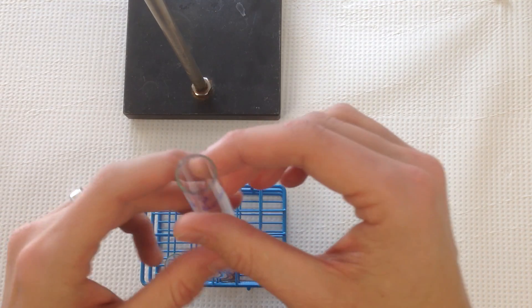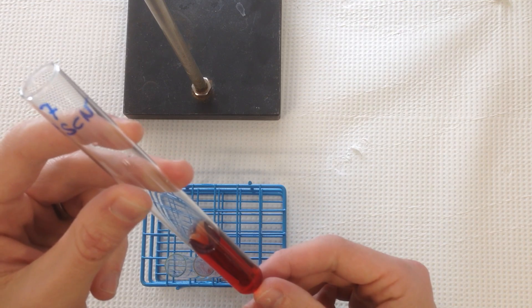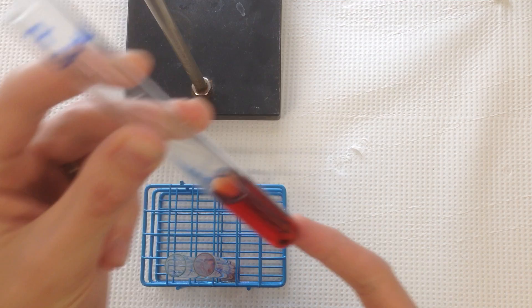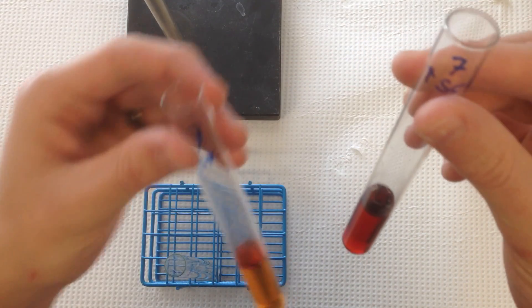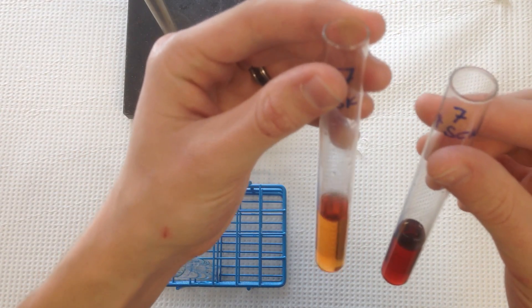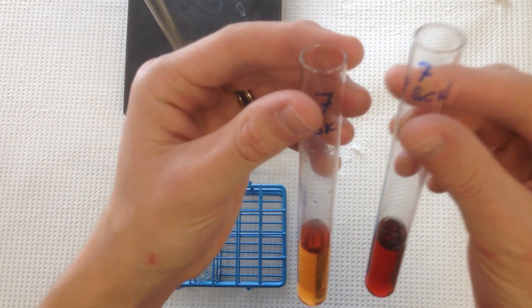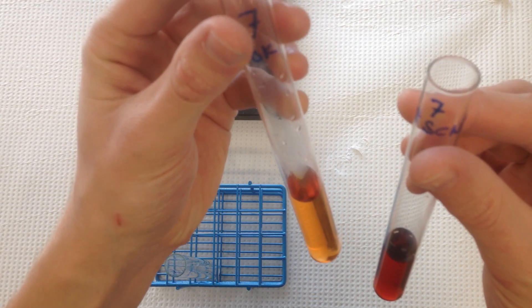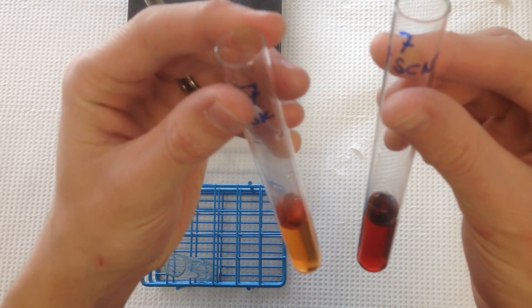Now, if you use the extra concentrated thiocyanate solution instead of the .0025 molar stock, you end up with something much darker than the orange that test tube 7 really should look like. What it should look like you see on the left, and what you get if you use the overly concentrated .5 molar thiocyanate you can see on the right. So make sure to use .0025 molar thiocyanate rather than the much more concentrated .5 molar solution in Part B of the experiment.